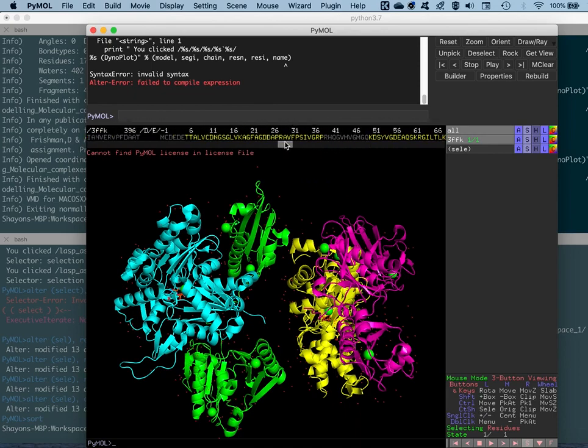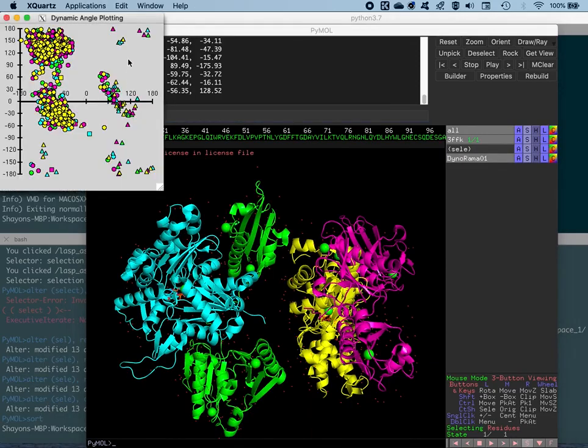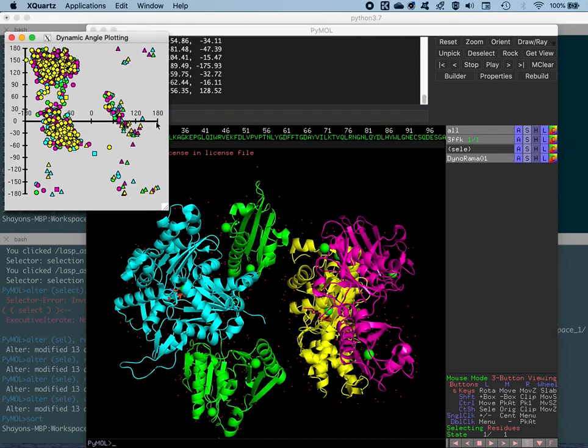And then if you go further down, you'll find that chain E is colored in yellow. Okay, so now we are gonna generate another Ramachandran plot based on these coloring schemes, so it will be easier for you to see the representations that are done based on the chain selections. So we'll type in the same command again, Rama, and then all, and press enter. And there you go. You'll find all the designated amino acid residues colored according to the chain.